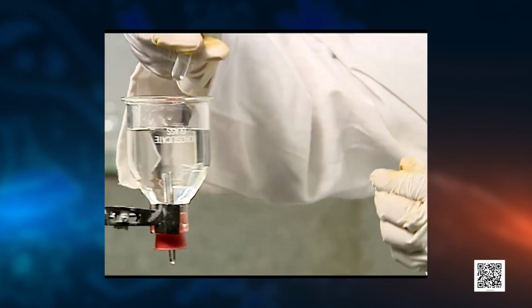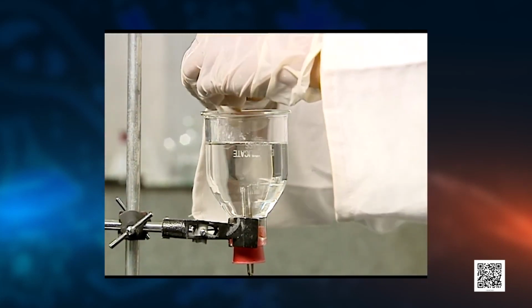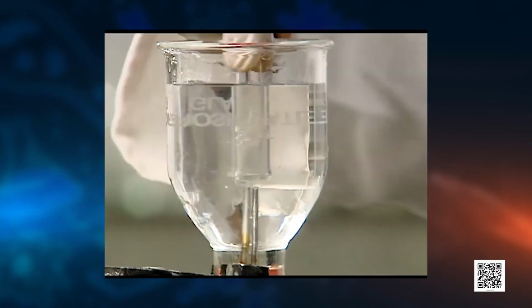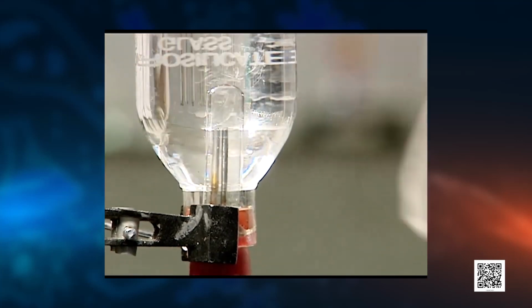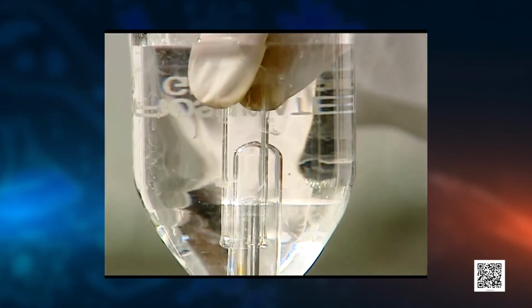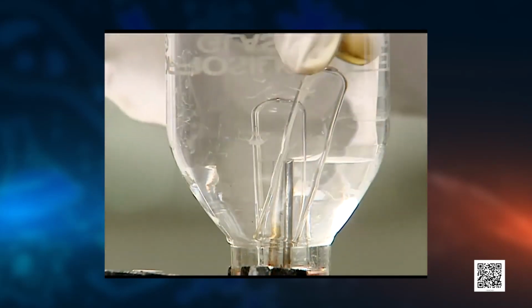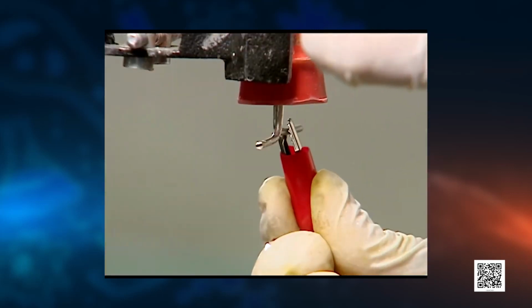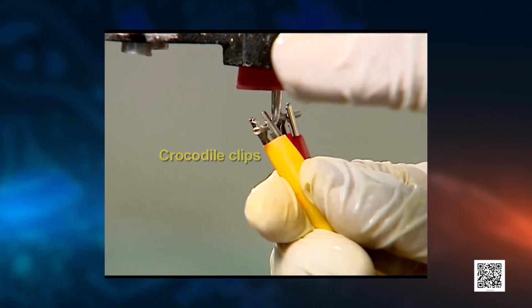2 small tubes are taken, filled with water to the brim, and we are now inverting them over the 2 carbon electrodes. When you are doing this, care has to be taken that no bubble is formed. Otherwise, we will not get to know about the exact ratio of the gases. Now both the test tubes have been placed over the electrodes. And now the crocodile clip is attached to the 9-volt battery.